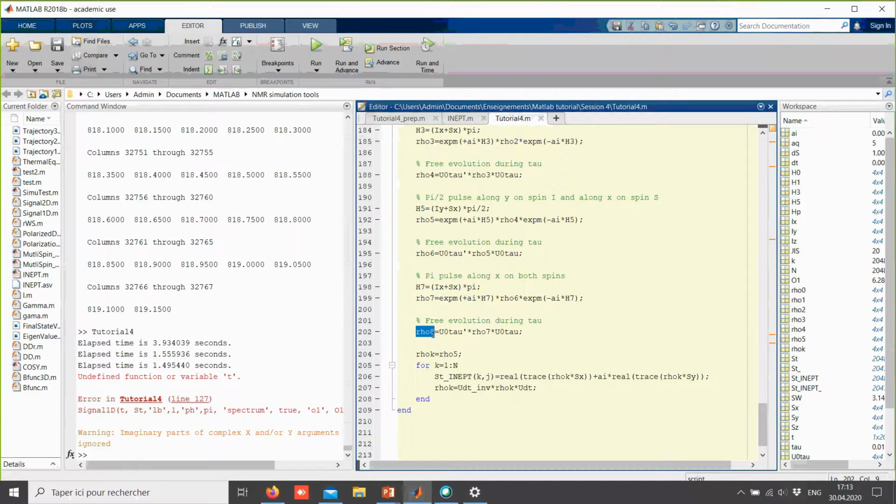Here, now row K, the initialization of this iteration, I have to start with this one, row 8. And all I miss now is to define the phases. So there are many ways I could do this.